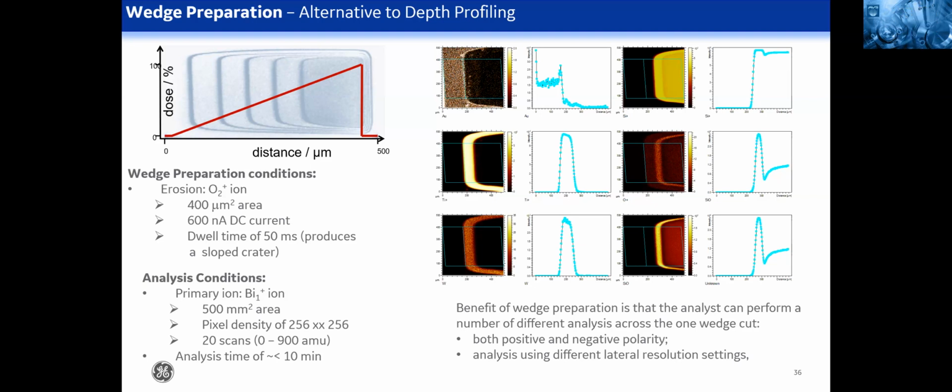All right, and one final question. Can you comment on ToF-SIMS used as dynamic SIMS and non-ToF-SIMS instruments, i.e. quadrupole, magnetic, in-static SIMS? Do I need to break that out, or are you good? No, I think I got it.